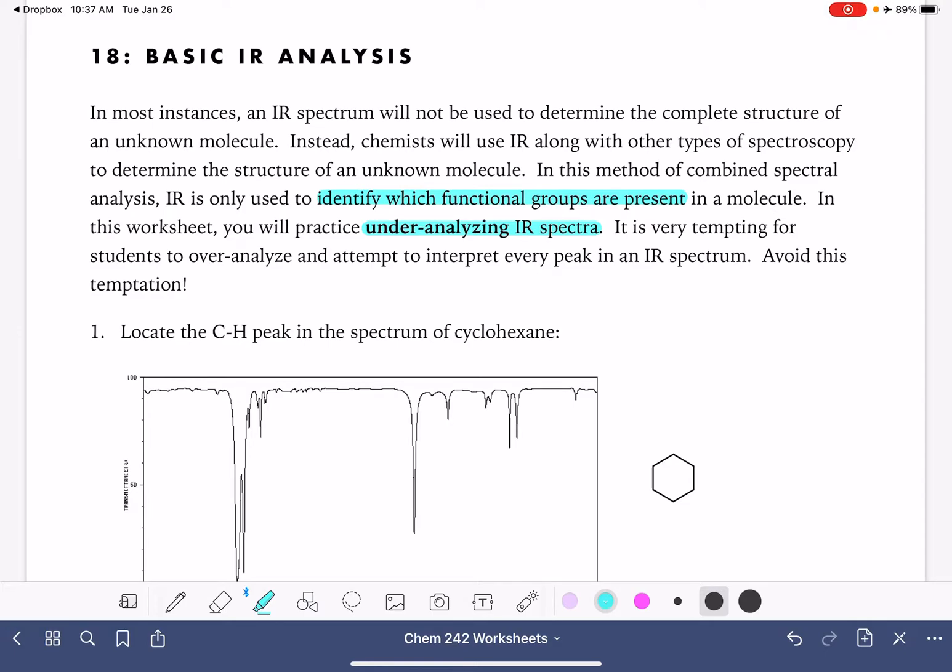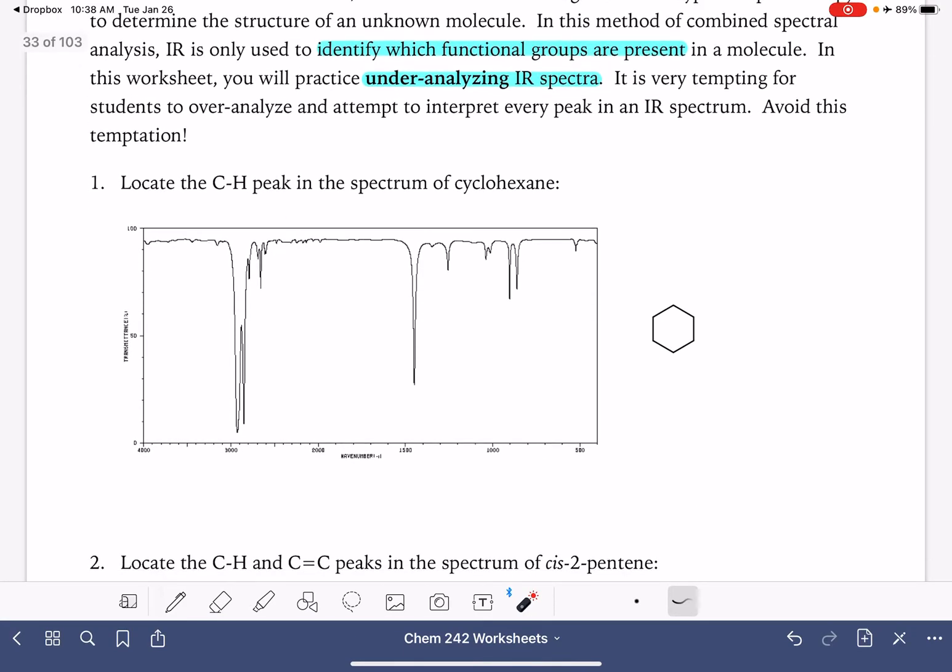The other option that we have when we're using IR is if we're dealing with a molecule that we are pretty sure we know what it is, we just need some verification. We can take the IR spectrum of that sort of an unknown molecule and we can compare it to what we would expect the spectrum to be. So we're sort of referencing, using the IR as a reference. But in this particular video, on this particular worksheet, we're really just going to be focusing on using IR to help us identify which functional groups are present in the molecule, and we're just going to look at a lot of spectra.